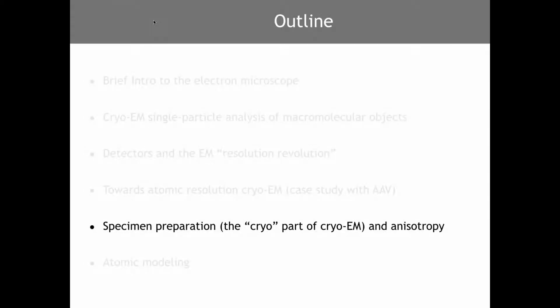In the higher energy artifact, I guess, right? Does it have more sample movement there? Particle movement? You know, I'm not sure if it's more or less. With 200 kV, they're lower energy electrons, so I would expect it to be perhaps more, but I'm not sure they've done these quantifications. I know they haven't done side-by-side comparisons with the pairs.